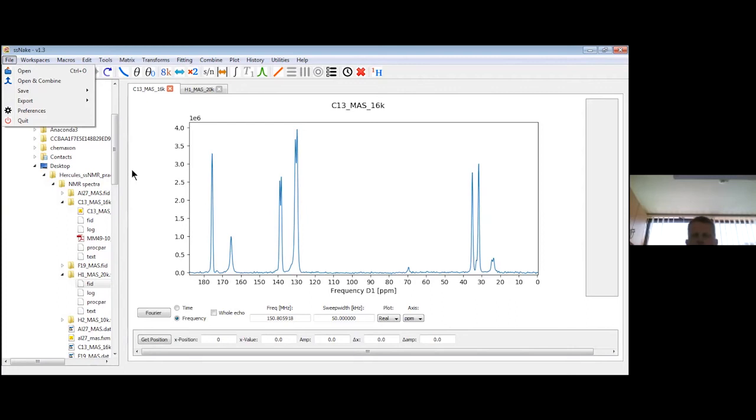Is there anything else that I should say about it? I mean, if you want, I can let you play with this program for 10 minutes or so, or we will continue with the first example with DMFit, and after that first example, we will have a second last break. I don't know. And of course, it's also time for questions. I will stop sharing, and see if there are questions.